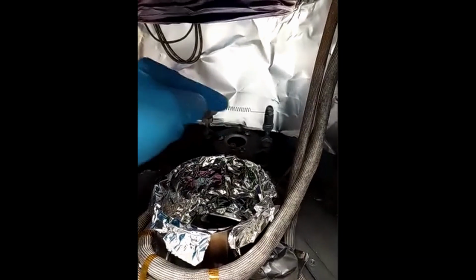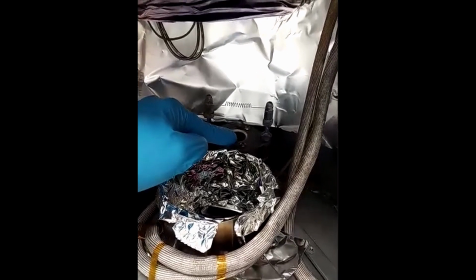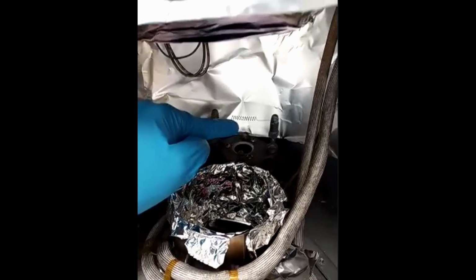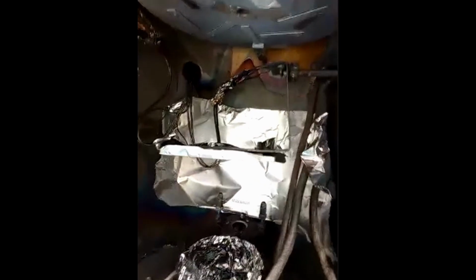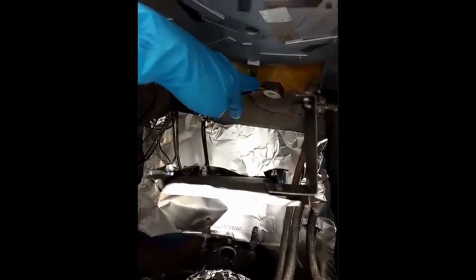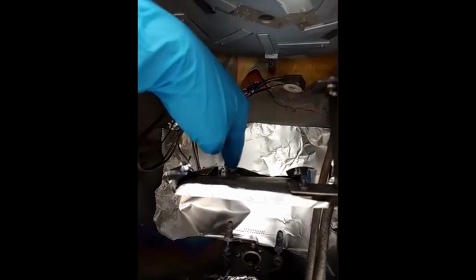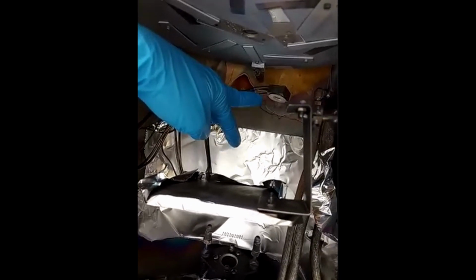This is the ion gun. That's the filament for the ion gun, and it's bleeding oxygen through it, so it ionizes oxygen, and it accelerates the oxygen ions up towards the substrate, which is here. And there's the shutter in the middle. And the quartz crystal monitor is that guy there. And that's in the path of the ion beam. And that's why when we turn on the ion beam, you'll get some noise.